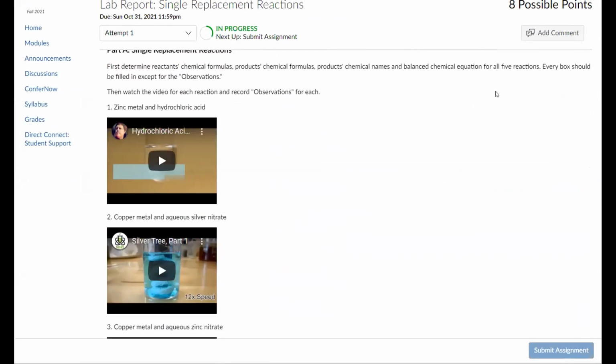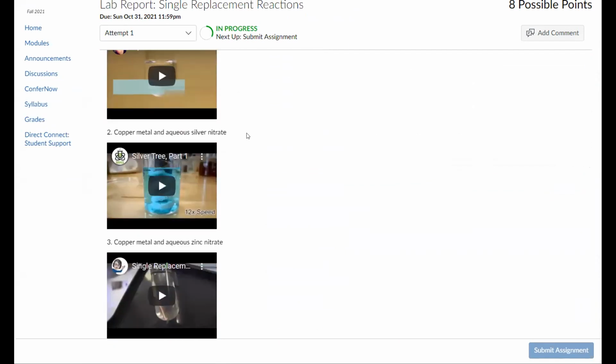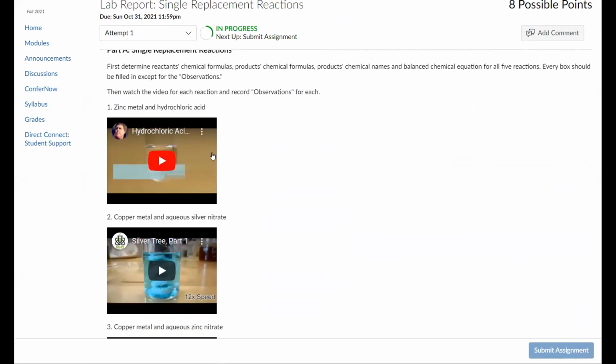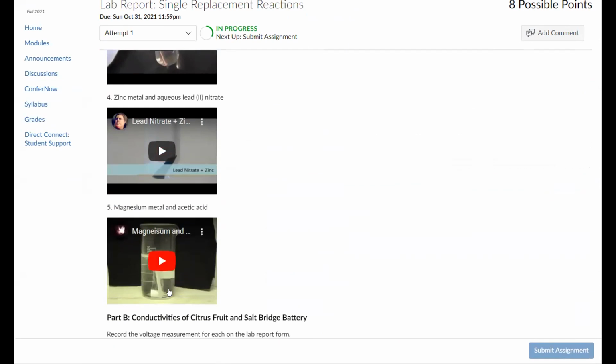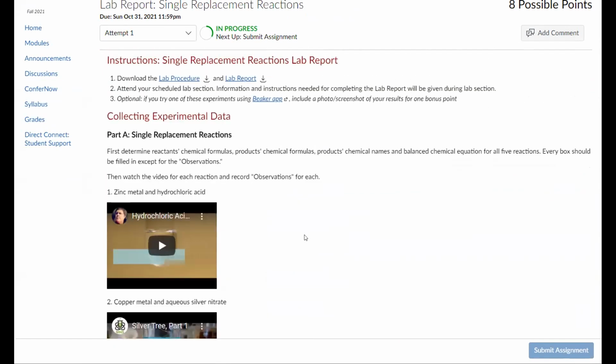So you have the predictions for those 5 experiments, and these are the videos, the experimental results. Here are the observations. You have 5 videos, and you will then put in the observation section of your lab report what you see. It doesn't have to be detailed, just what you see.